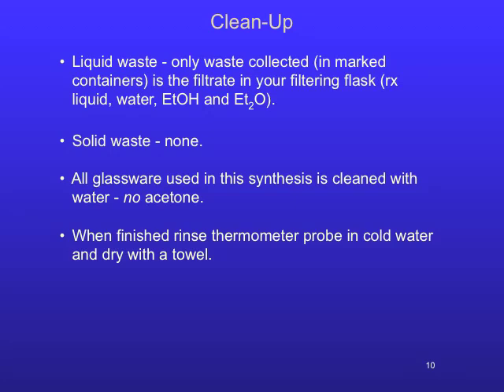Be sure to neutralize any remaining acid in the filtrate with sodium bicarbonate prior to pouring it into the common waste container. All other aqueous waste can be discarded down the drain with cold water. There is no solid waste generated this week. All glassware used in this synthesis can be cleaned with water. No acetone is used. When you are done, rinse the probe with the digital thermometer with cold water and dry it with a towel.